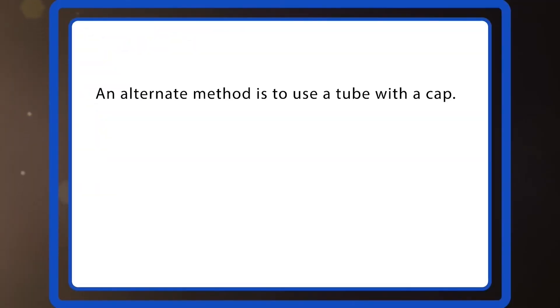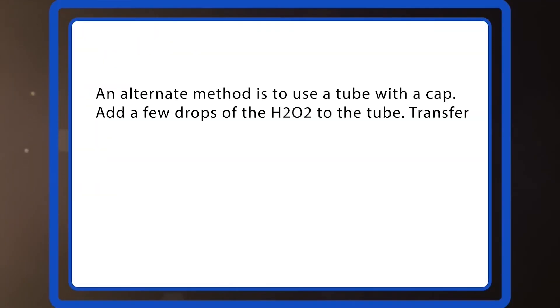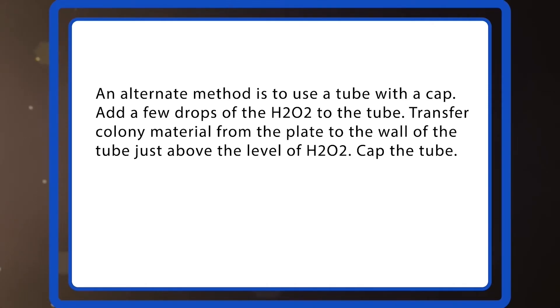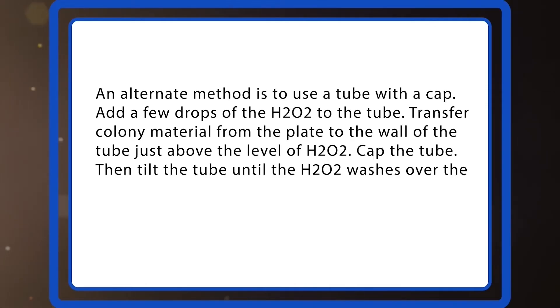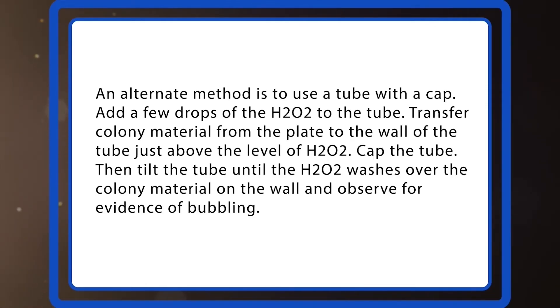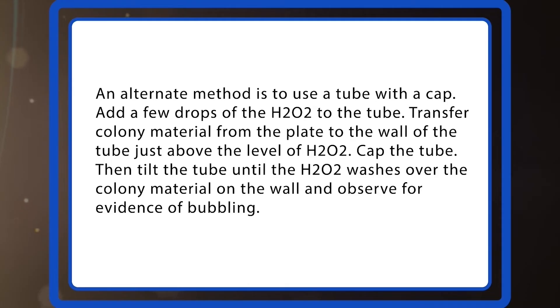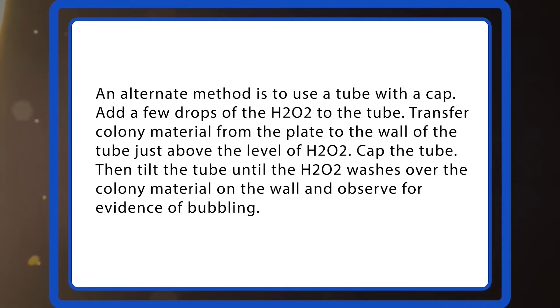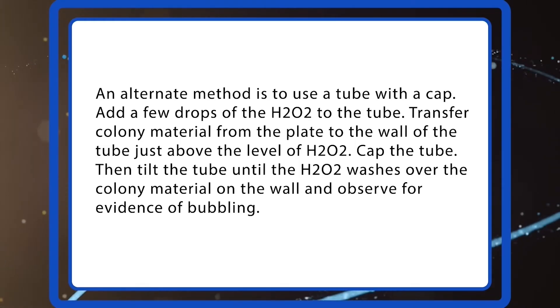An alternate method is to use a tube with a cap. Add a few drops of H2O2 to the tube. Transfer colony material from the plate to the wall of the tube just above the level of the H2O2, then cap the tube. Tilt the tube until the H2O2 washes over the colony material on the wall and observe for evidence of bubbling.